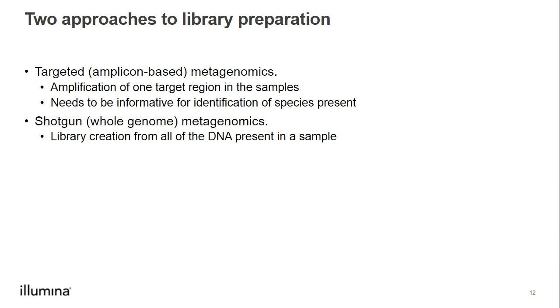The second method is shotgun metagenomics. With this method, we create sequencing libraries from all of the DNA present in a sample. We will discuss both of these library preparation options in the coming slides.